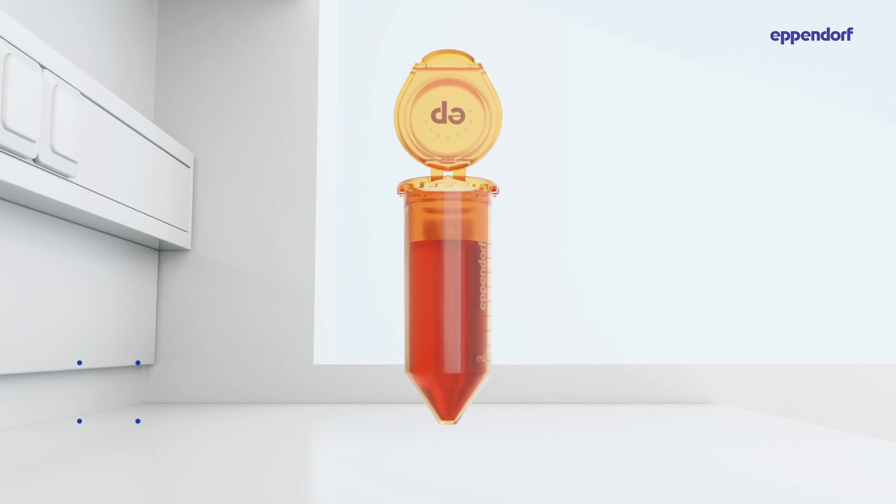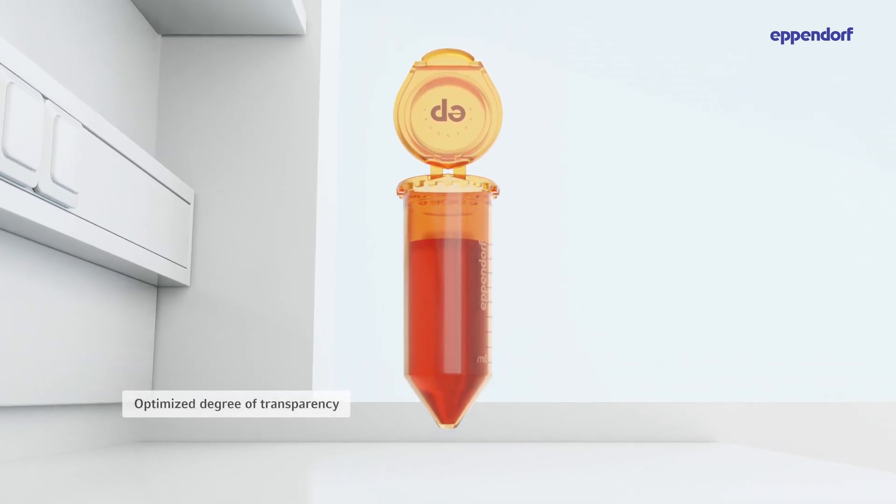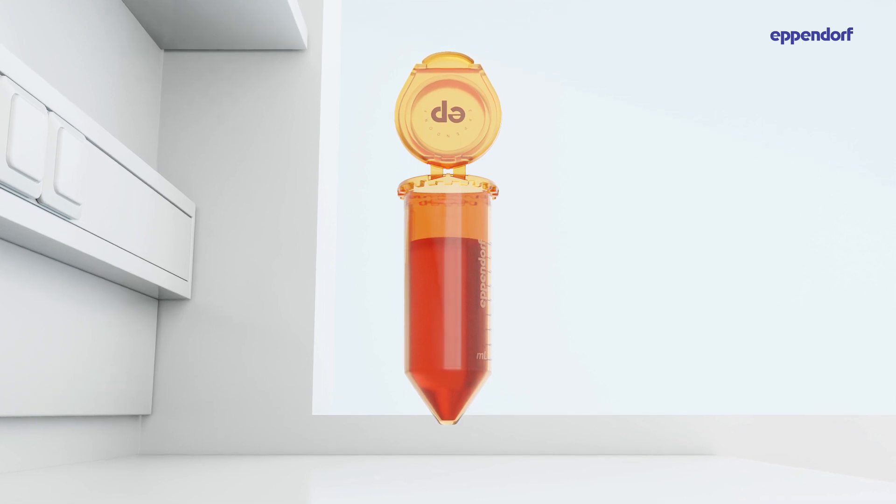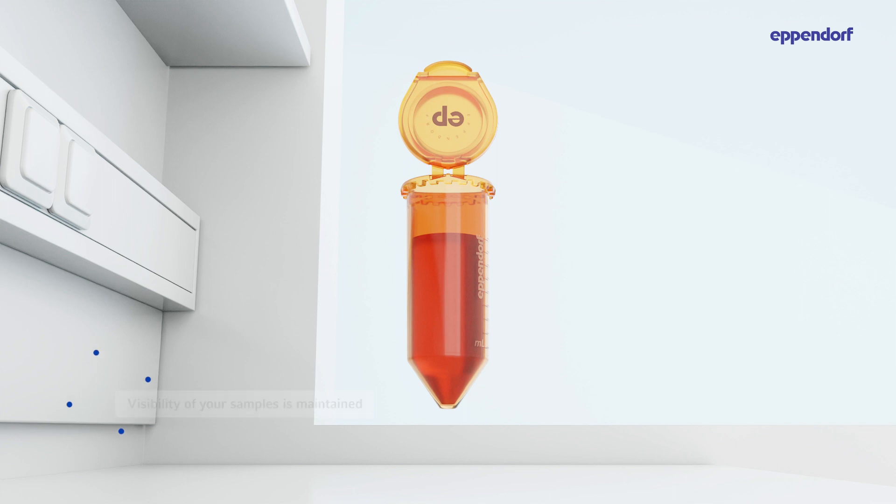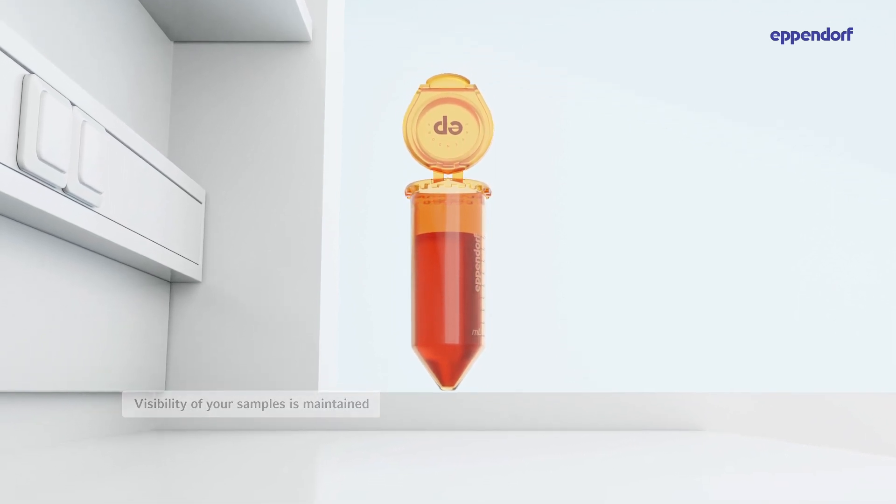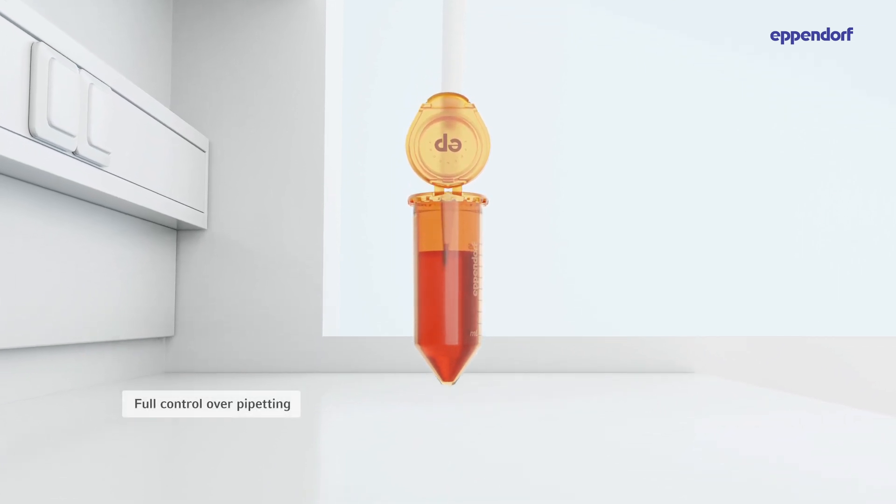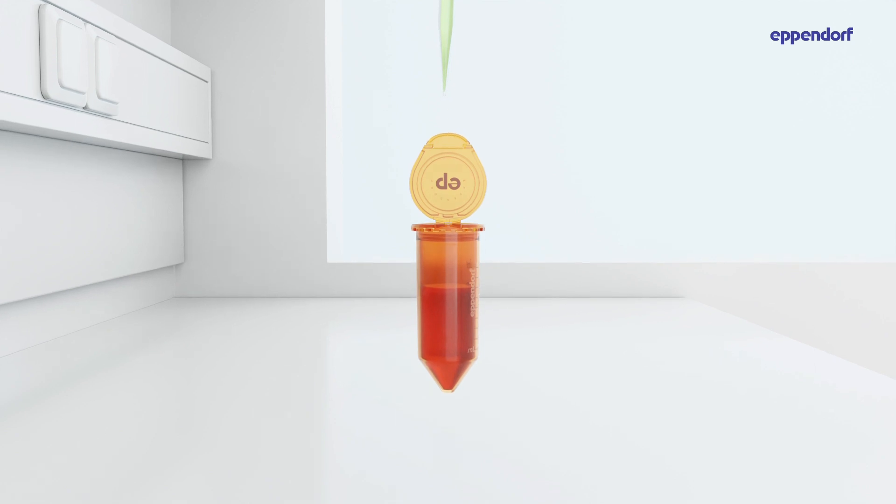To address this deficiency, Eppendorf developed an amber material with an optimized degree of transparency. By allowing for a slight increase in transmission of light in the low-energy range above 550 nanometers, perfect visibility of your samples is assured, as well as full control over the insertion depths of pipette tips, thus providing prevention against contamination.